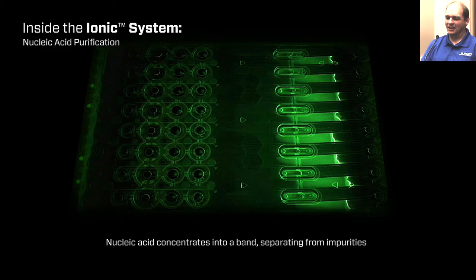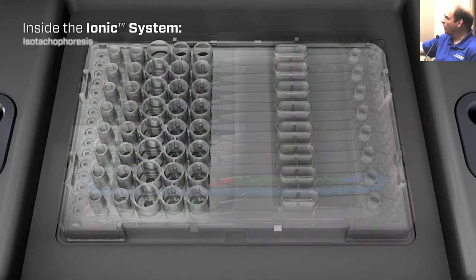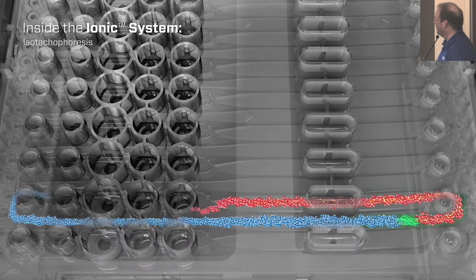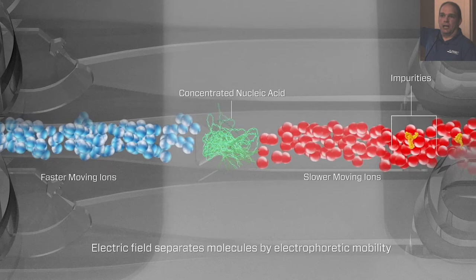And what you can see is as this process goes along, all that nucleic acid gets compacted onto that tight ITP interface, moved across the channel into the extraction well. If we overlay our cartoon back on top of that, you can see those fast blue ions in the front, the slower red ions in the back, and the nucleic acid literally riding on that interface between the two of them as these slower impurities are dropping back behind.